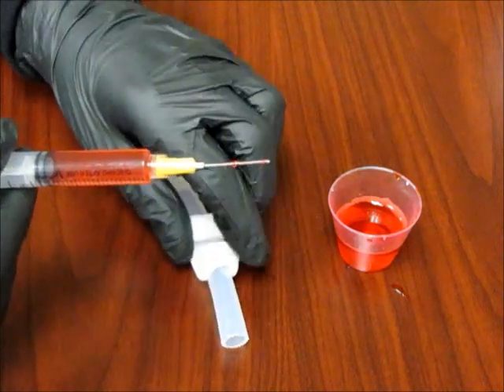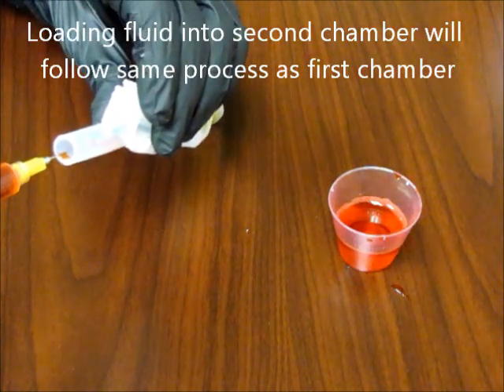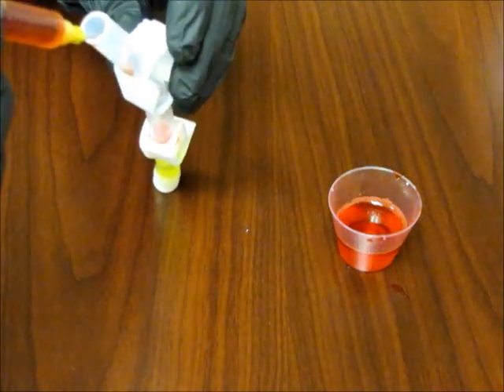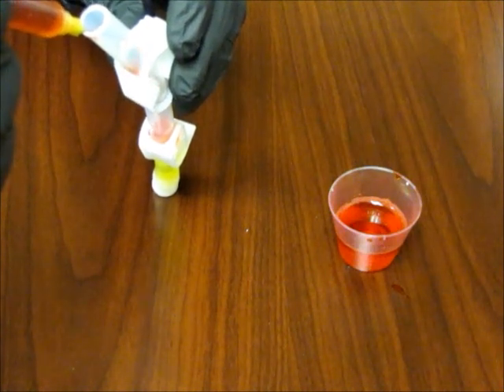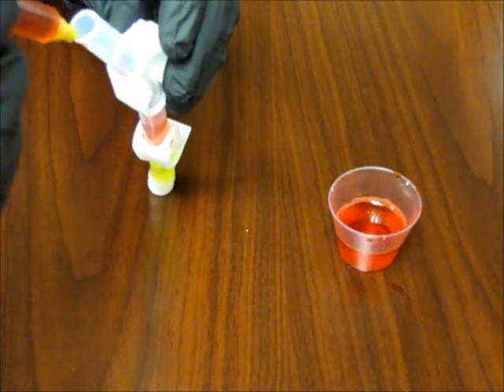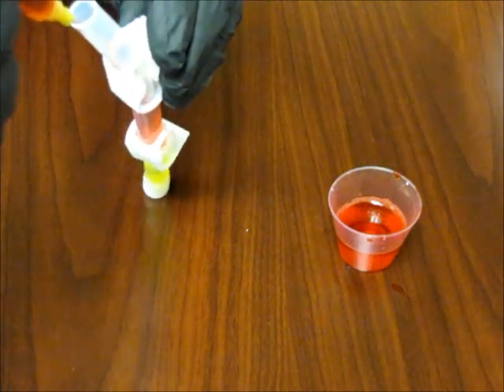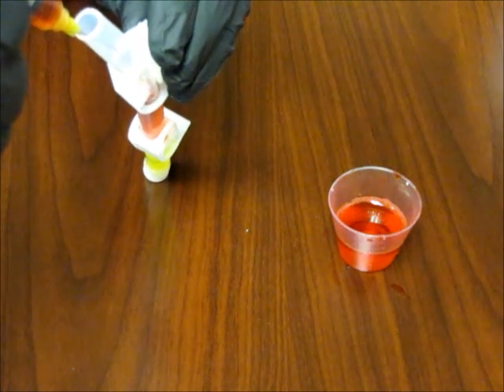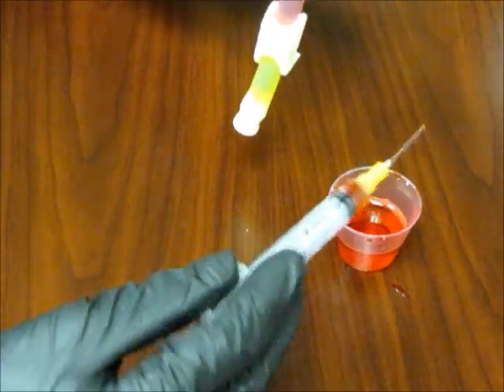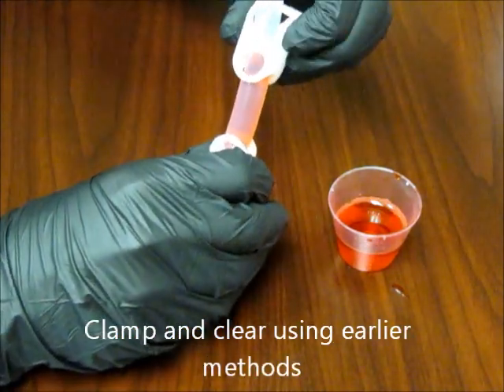Loading fluid into the second chamber of the mixture tube will follow the same process as the first chamber. Load a syringe and slowly drip the fluid into the mixture tube, letting the fluid drip down the sides of the tube. Once the fill is complete, clamp and clear using the methods that were shown earlier in this video.